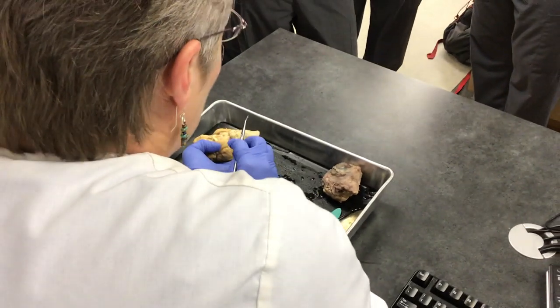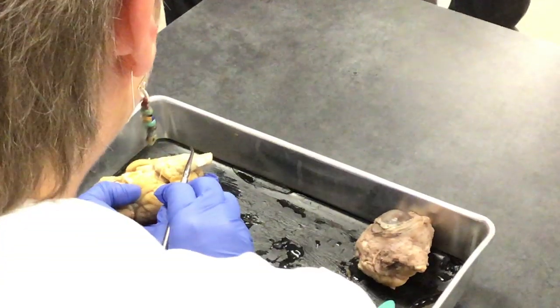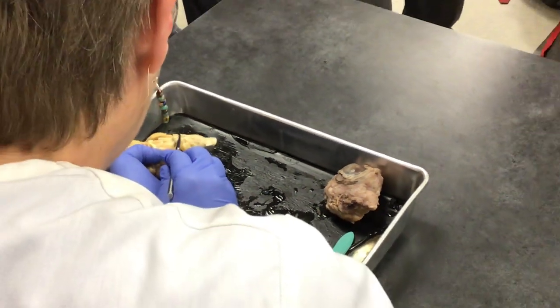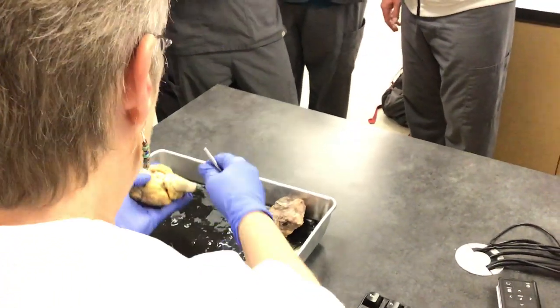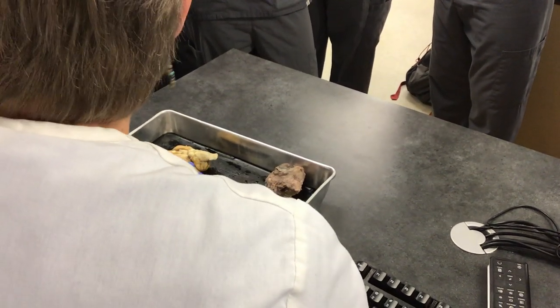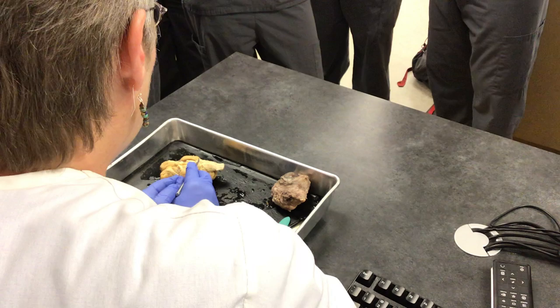This is the brainstem. What do you think this is? It starts with an N — the medulla oblongata. And what do you think this would be? It starts with a P — the pons. If you get confused on the test, just remember N comes before P, so this is going to be the medulla oblongata, and this is going to be the pons.